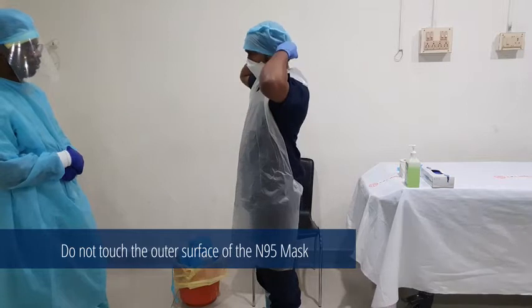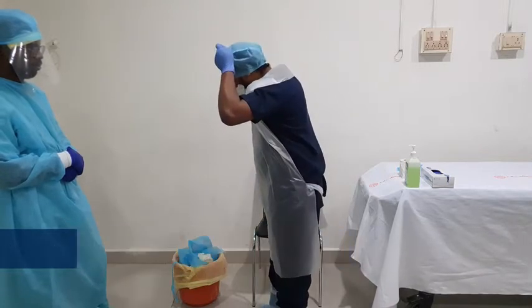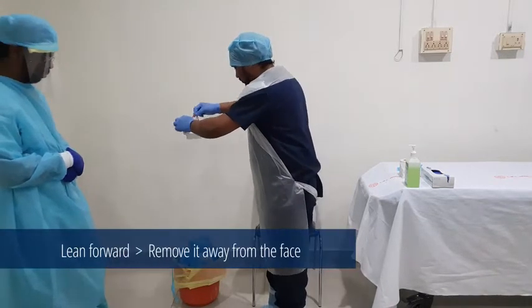While removing the N95 mask, make sure not to touch the outer surface of the mask while putting it into the appropriate container.